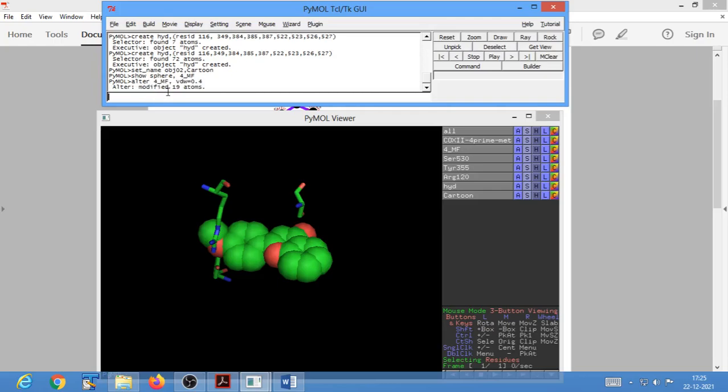Okay, it appears that nothing has happened because we have to use another command called rebuild.